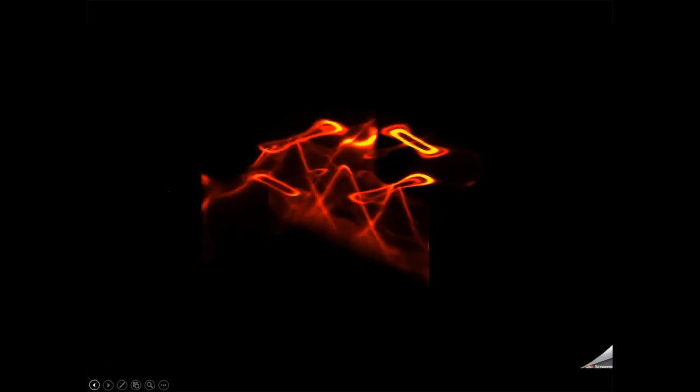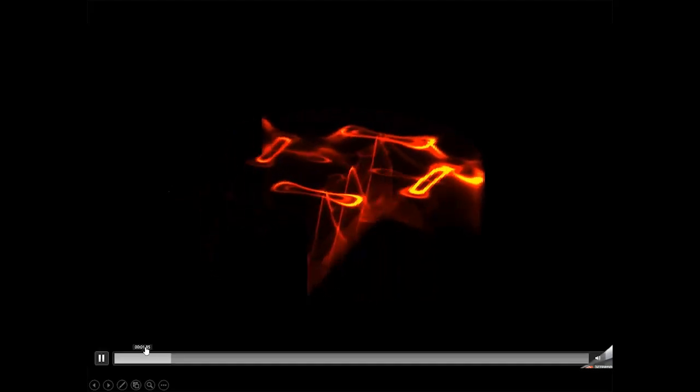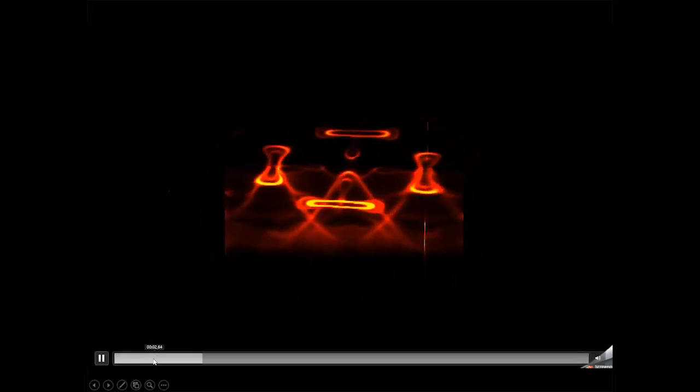So let's have a look at an exemplary ARPES spectrum. It looks like that, and you may ask me what the hell is that, because it's not that clear at the beginning, maybe. So we have to start to understand this. We have to start with the electronic structure of solids, because you have some object here.